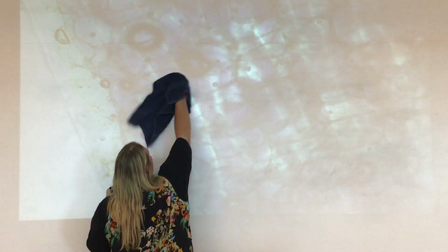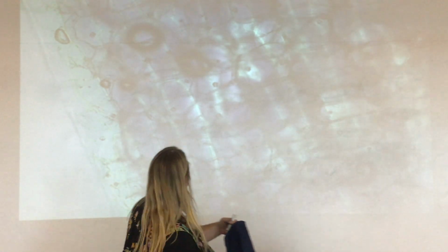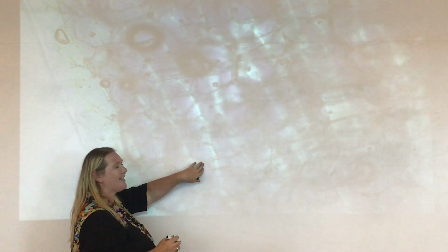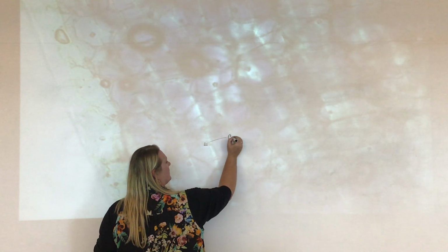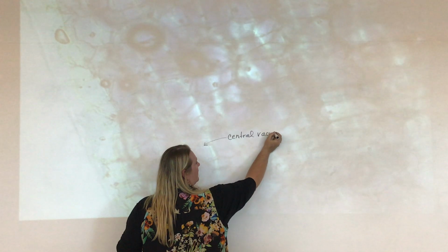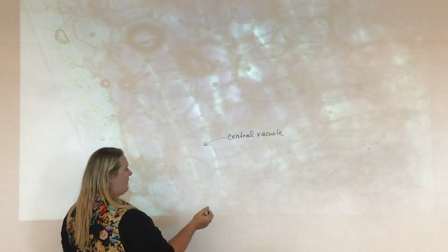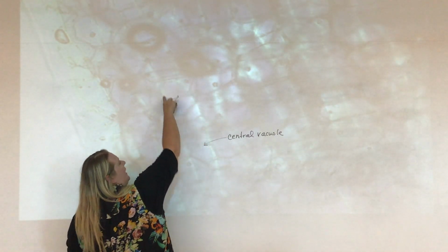and we look at the pigment inside of this cell, this pigment is stored inside the central vacuole. So the purple is the central vacuole. And it's going to store this purple pigment that gives that red onion or that purple onion its color. We see a kind of a white outline.